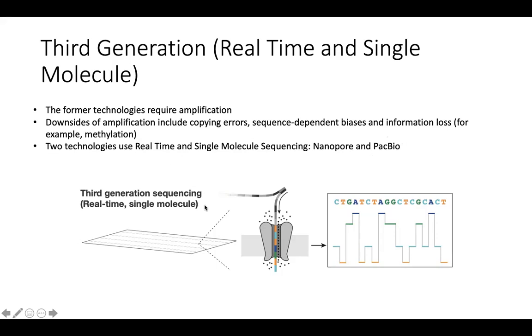So the thing about these newer technologies is that they sequence each molecule at a time, in each pore. Here, I learned this with Jaime.